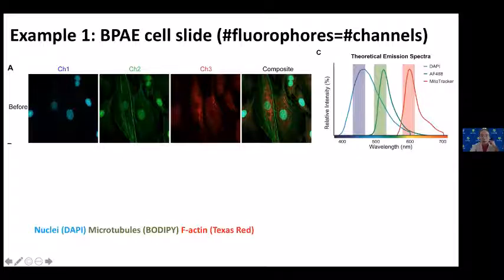For the blue signal, you may see that it has a similar structure showing up in the green signal as well. We can also tell this by looking at the emission spectrum, which is information measured by other people and available online. We can see that the blue spectrum overlaps significantly with the green signal and can be detected by our green band of the detector. That's why we see the double signal in the green channel.